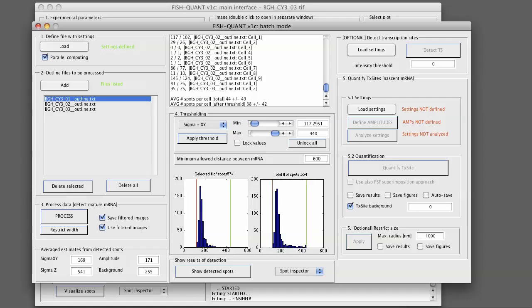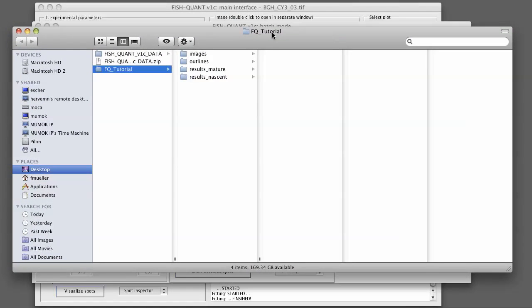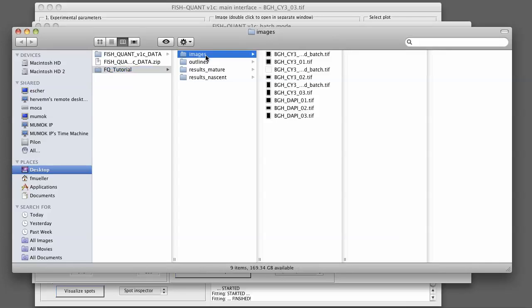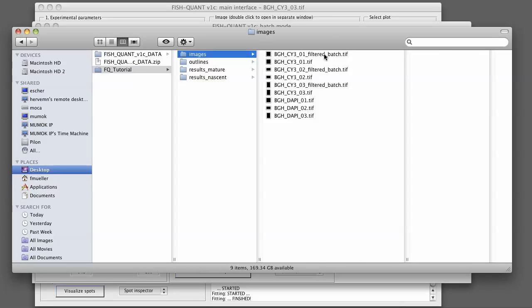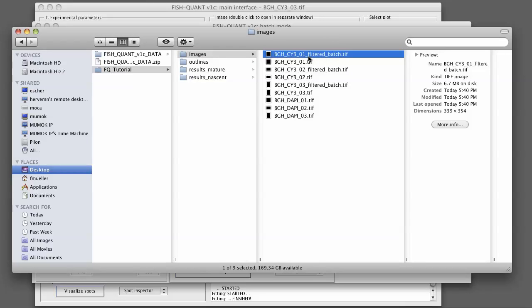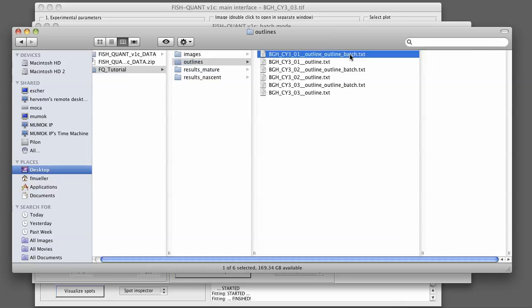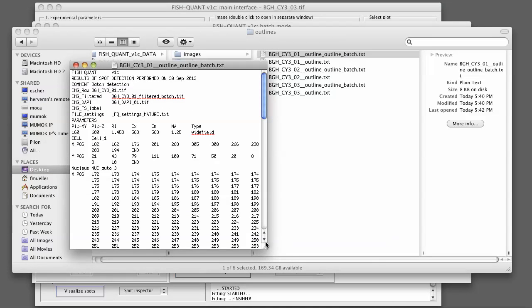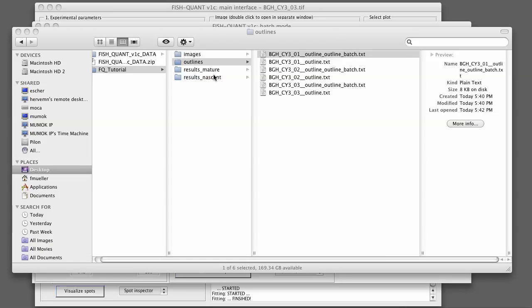One thing I also want to show you, if you go to the folder containing all the data, is that we now have new image files indicated by underscore filtered underscore batch. If you click on those, you see that they now contain a reference to the filtered image. So in the future, you can work with those outline files.